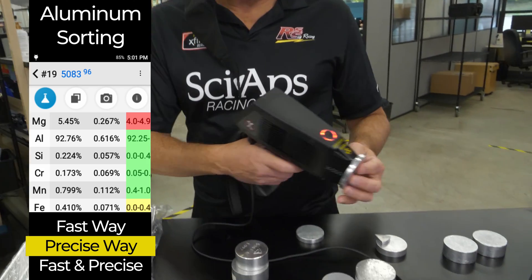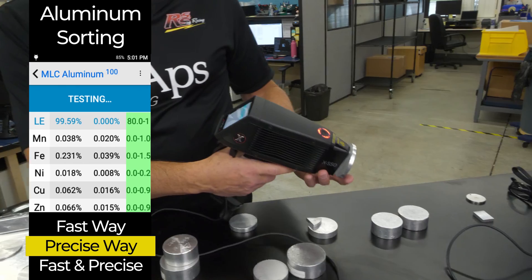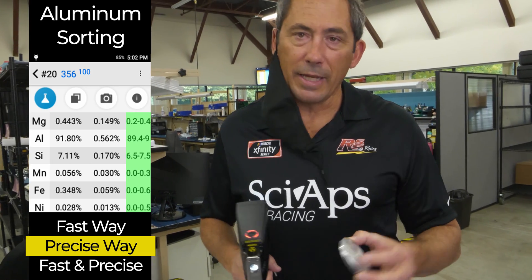Finally, maybe my favorite thing to shoot — this is a 356 casting alloy. This is about 0.3% magnesium. A couple of seconds and it pops right up. I love showing that measurement because that low magnesium has historically been really difficult for x-ray guns, and we're doing it in a couple of seconds.